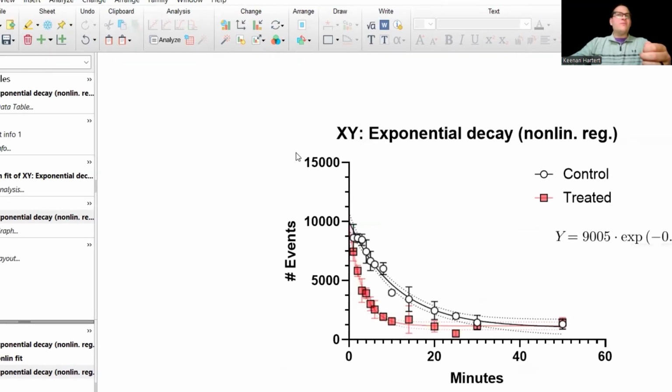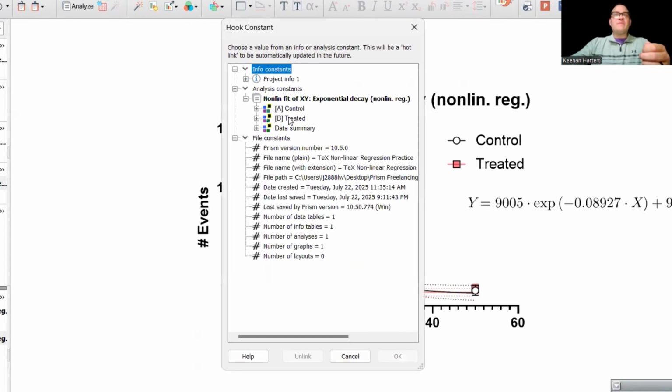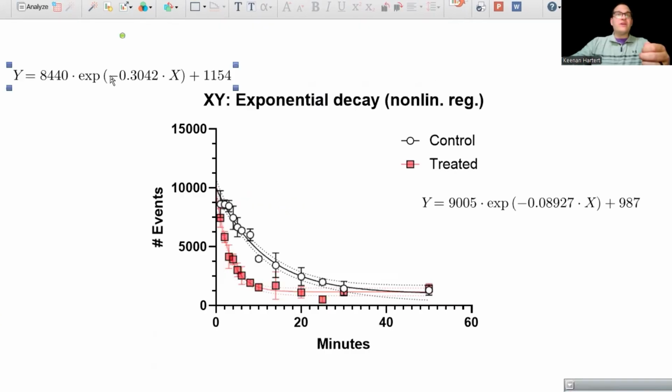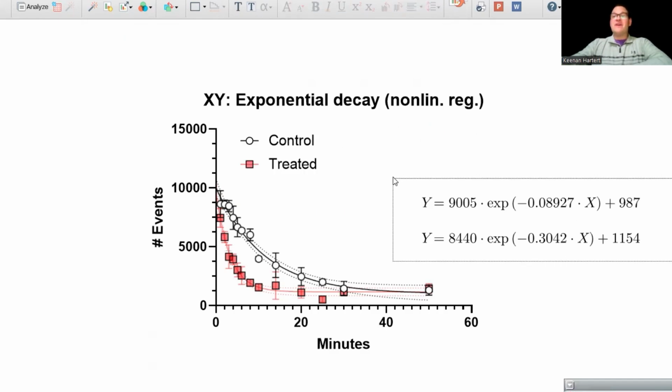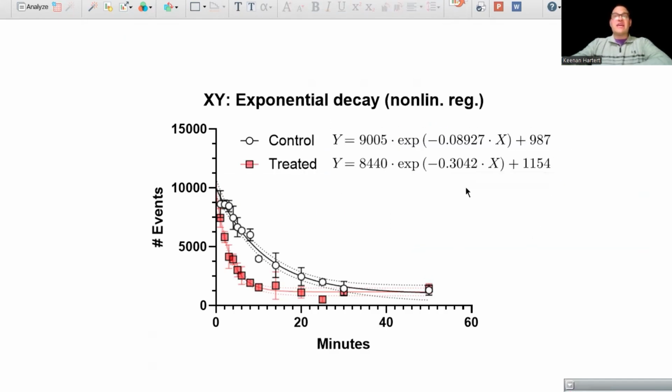And I'm actually going to be able to run that a couple other times right here. So as I go into the treated format, I'm going to say, all right, I want the TeX equation. Let's take a look here. Perfect. So given everything, I now have the ability to just run a universal formatted setup here. This one doesn't even actually give us the same lower and upper format that we had before, or that TeXs often have. But again, you're now free to customize how these are going to get put in. It also just has the data nicely set up for you, everything like that.